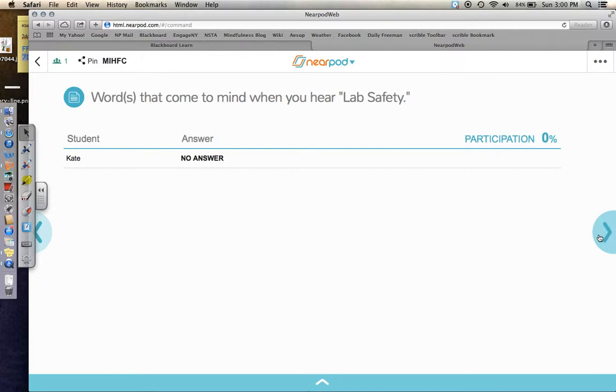So running, neatness is definitely a big thing. You want to keep your work space neat. Let's see, procedures. So I'd give the students a minute to think about that and to type in their answers. So I just typed in mine, and it should come up briefly.